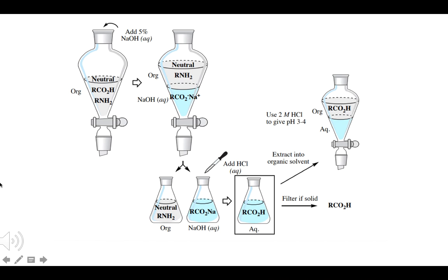A good separation technique is acid-base extraction. It removes chemicals from a mixture by their miscibility in a new solvent, or how well they dissolve in or mix in it. Remember, all non-charged molecules begin in the organic layer.